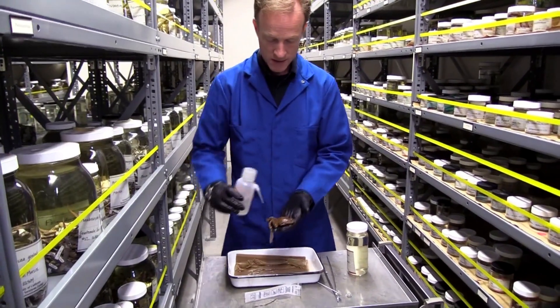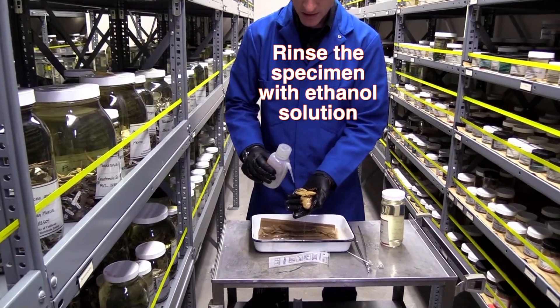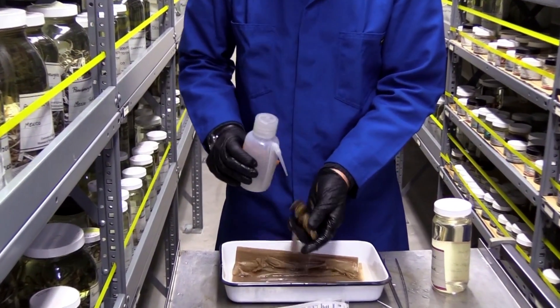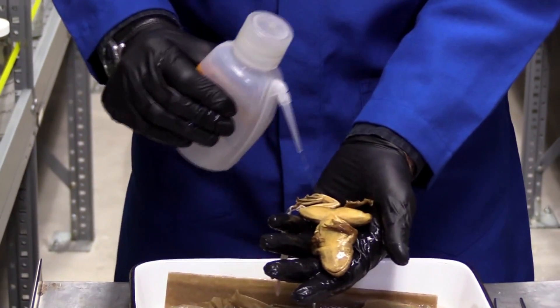The first thing I want to do is rinse it to make sure that there's nothing just stuck on there that isn't part of the specimen and could give us a false positive. So I'll rinse it off with ethanol, spraying pretty hard to rinse it as best I can.